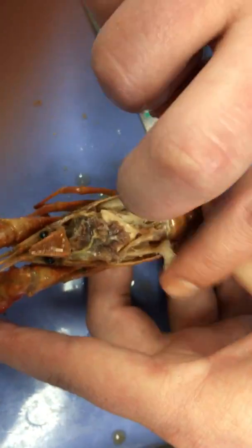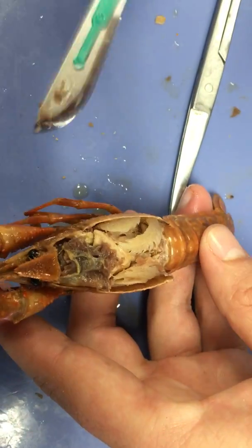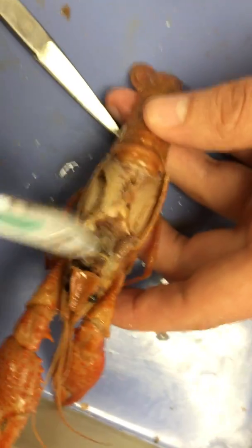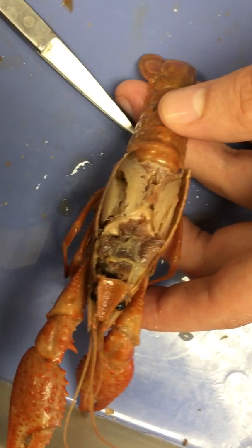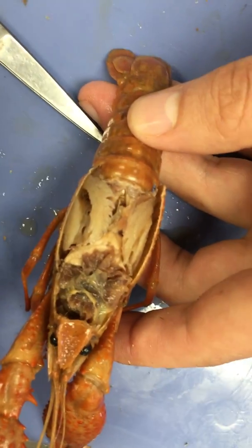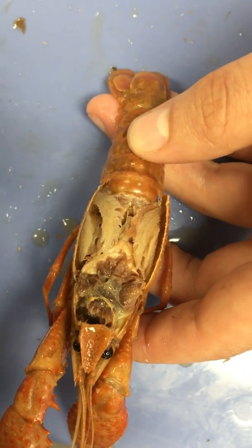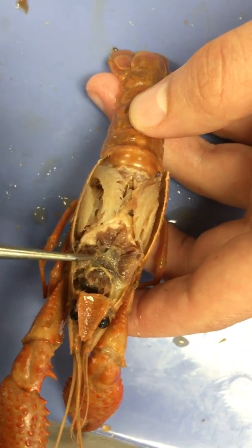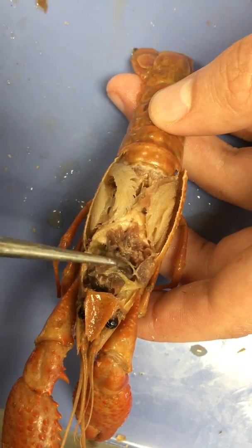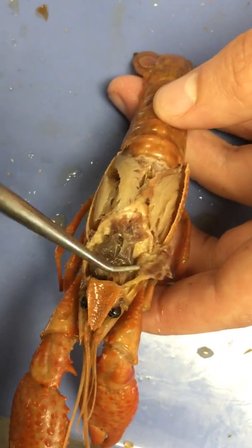Here we have the innards of our crawfish pretty well exposed. We can already see a couple of things prominently. These big purple lobes on either side, just behind the eyeballs — these are the mandibular muscles. The mandibular muscles attach to the mandible; that's their jaw muscles, what's going to allow them to move those mandibles to chew their food. When taking off that cephalothorax, you want to be very careful not to destroy that mandibular muscle too much.